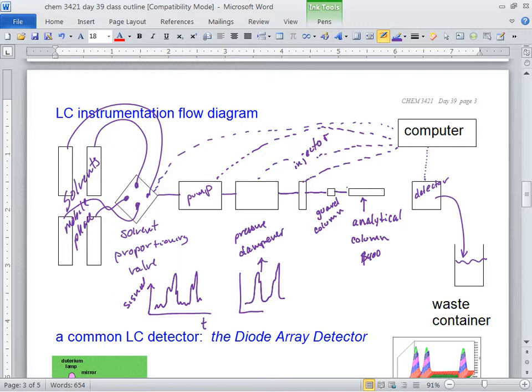This is where the chromatography is being done. This is where the stationary phase is. Okay. And then it goes on to your detector, and you get your chromatograms. Okay. So out of the computer, right, and you get your chromatograms. You know, time and signal on your little computer screen.